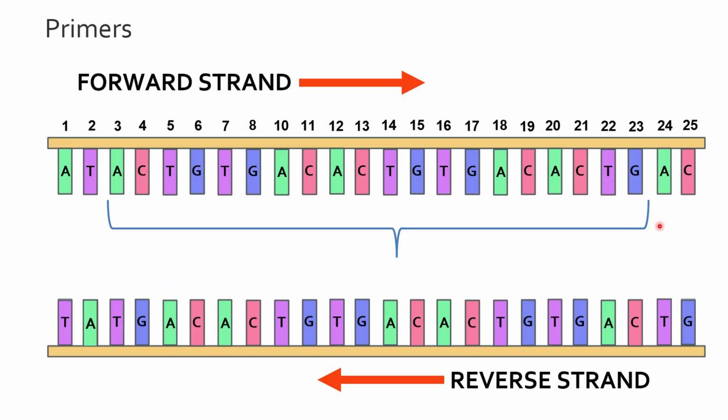So first, we use a special enzyme called helicase that separates these two strands into individual ones. And this is true for any of the DNA processes that we're talking about. It splits them in half, and then it makes extra copies of them through a process called amplification, so that we can read all of those extra copies and make sure that we're getting an accurate reading. If there's a slight mistake in one read, we're able to catch that by essentially proofing it, looking at many copies of that area.